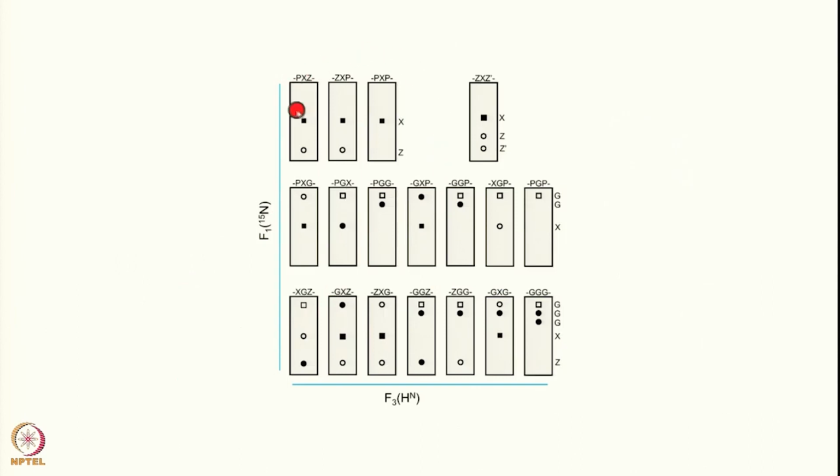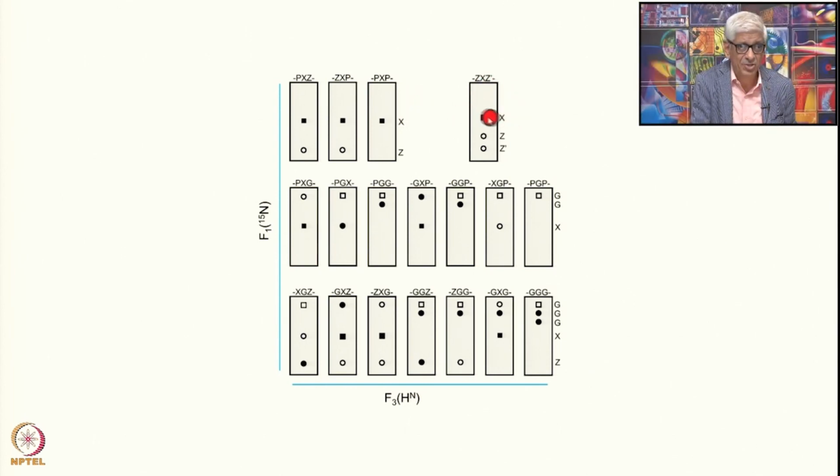Okay, of course, if there is a proline, it will not produce a peak, therefore you will have only 2 peaks, not 3 peaks, because there is no amide proton on the proline. But in a generalized sense you will have the self peak which is positive, and the 2 sequential peaks will have a negative sign. I represent this as Z X Z prime. X is the central peak which is the self residue, and Z and Z prime are the I minus 1 and I plus 1 residues. Okay. These ones have a negative sign as indicated in the previous one if this is positive. The square indicates that it is the self peak of the same residue, and the circle indicates a sequential peak.